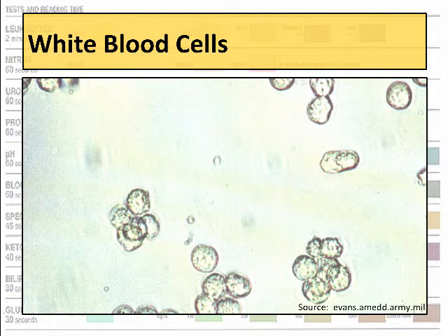You can also see the nucleus occasionally. This image isn't super great, but you can sort of tell that there's a nucleus in there. And generally having less than 5 is okay. They're wandering around the urinary tract, keeping things clean, so it's okay to find some of these. If you find more than that, that could be an indicator that you have a urinary tract infection, very common, or also there could be some kidney damage that they're coming in to help to repair. So keep an eye out for white blood cells because they potentially might mean something if in high numbers.